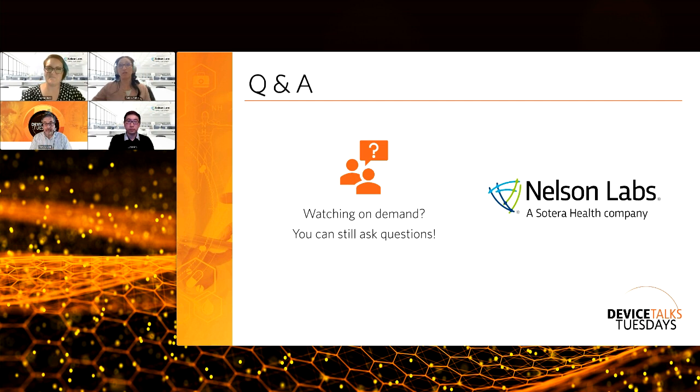That has certainly happened for some devices because we are using some interesting chemicals in our medical treatment now as we find ways to administer them to patients in a very safe way. But I would say it's good to be thoughtful upfront of toxicity and then go forward and do your best. Cytotoxicity is a great screening test. Again, it's not a catch-all, but it can tell you if there are toxic leachables that would most likely cause a systemic toxicity response that we might see later. Like we get a lot of plasticizers that come out of PVC that we know cause systemic or reproductive toxicity issues later that we don't catch in some of the other tests. I would not recommend to do animal testing on the raw materials. I would strive to do some in vitro analyses first and some good research on the materials you intend to use.